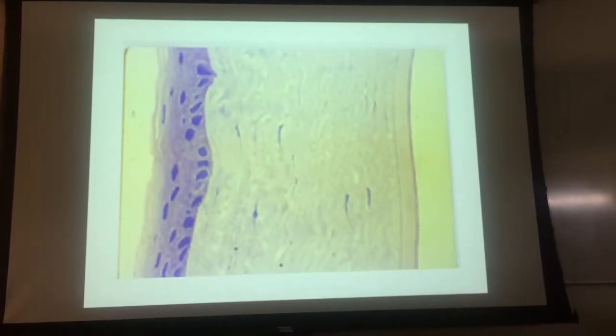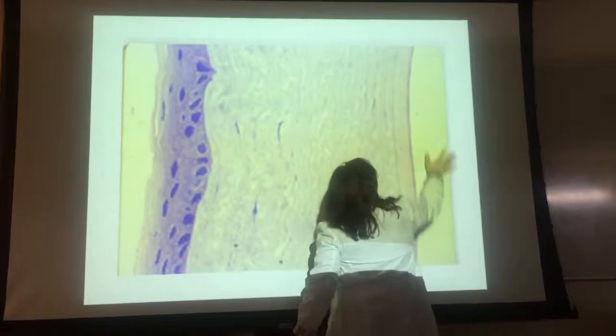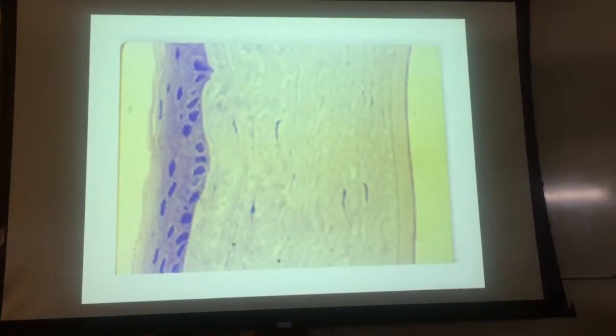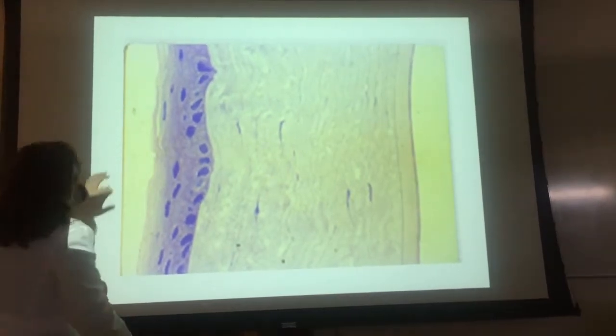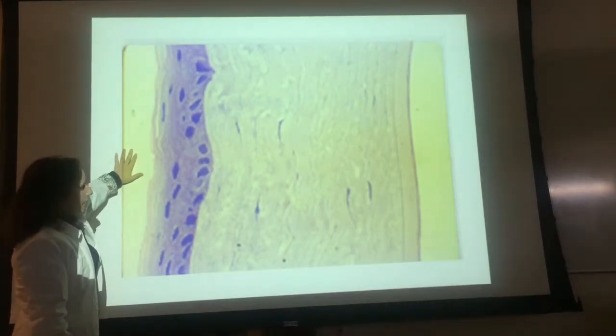Histology of the eye. So the person is looking this way, like that. So there's air right here. This is the cornea, right? The part that you might scratch if you have your contact lens incorrectly on there. Okay? So this is behind the cornea. So this would be the anterior chamber of the anterior cavity.